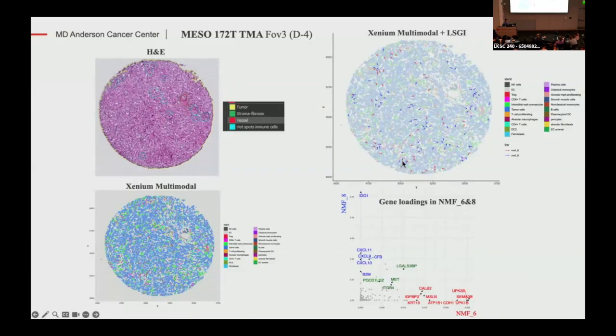So we're already able to identify the gradients at a single cell level to help us further decompose the tumor tissue into different pockets of activity, which help us understand the particular resistance to the treatment, or maybe there are therapeutic opportunities involved in looking at those data.